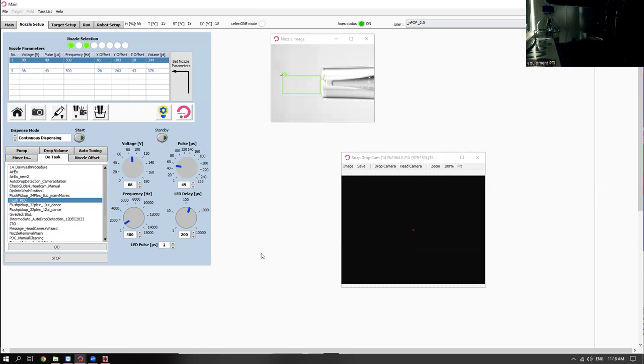We've done work with gel beads that have a cell inside of them or not, right? And so you isolate this gel bead with the cell. You don't want the gel beads without the cells. You don't want the cells without the gel beads. And so we set up a way to do that.